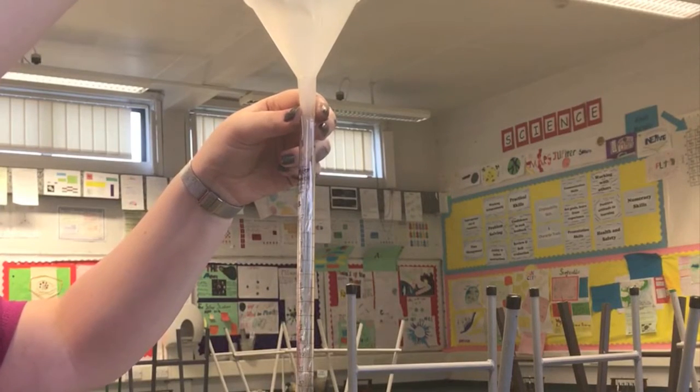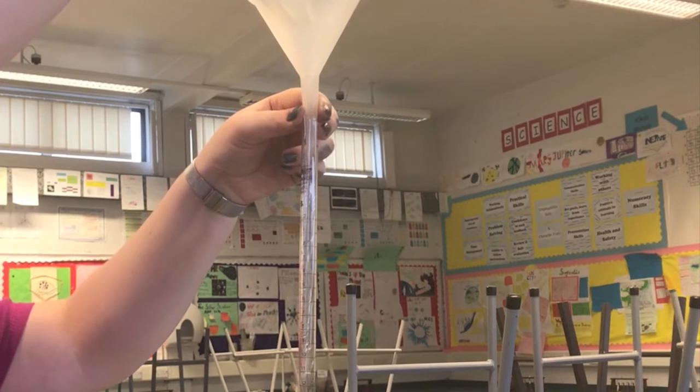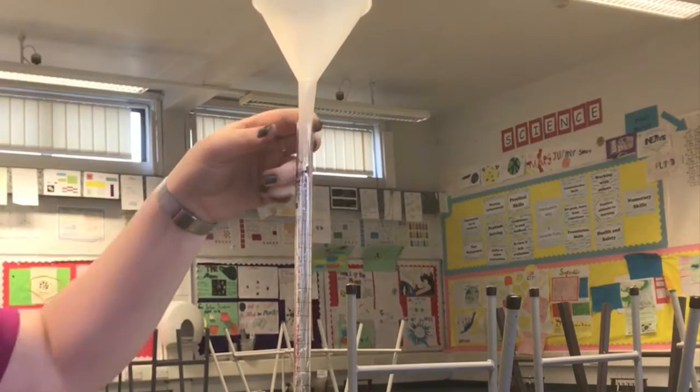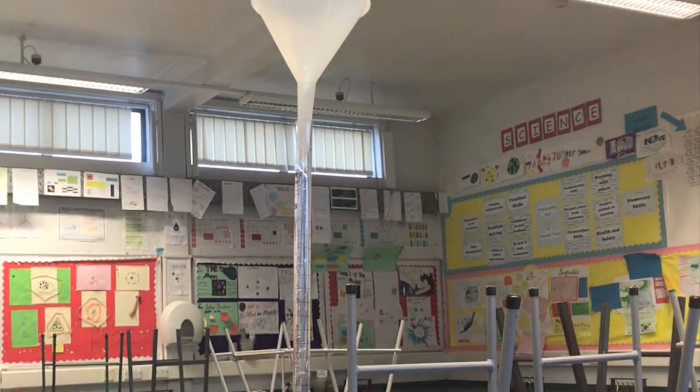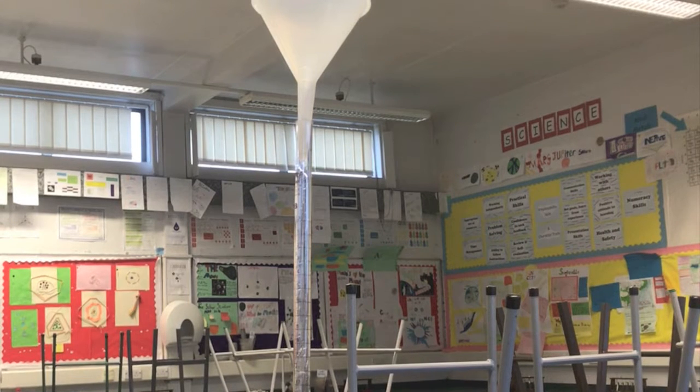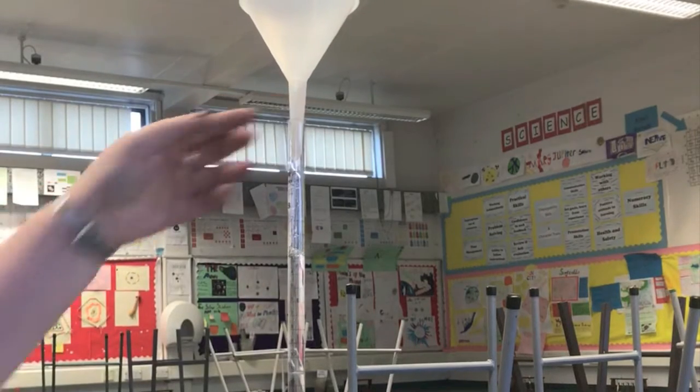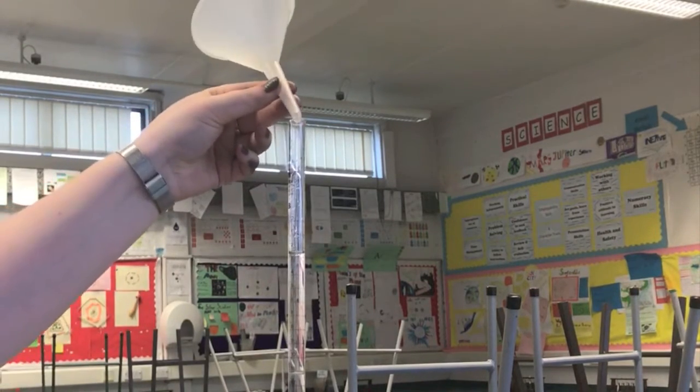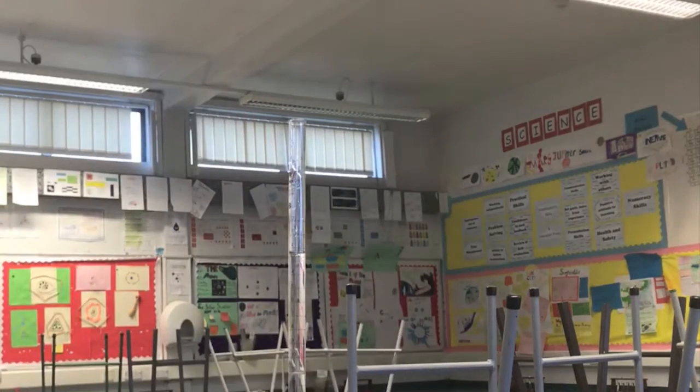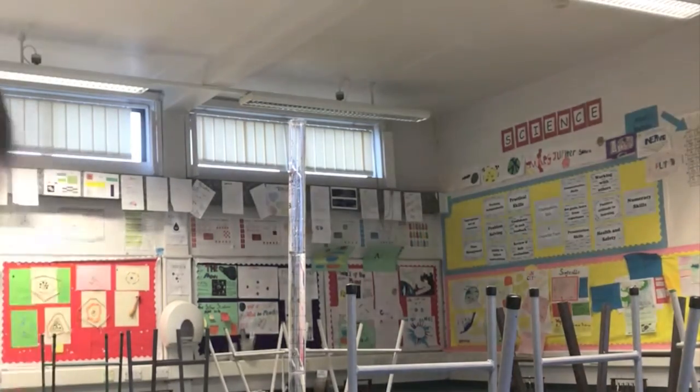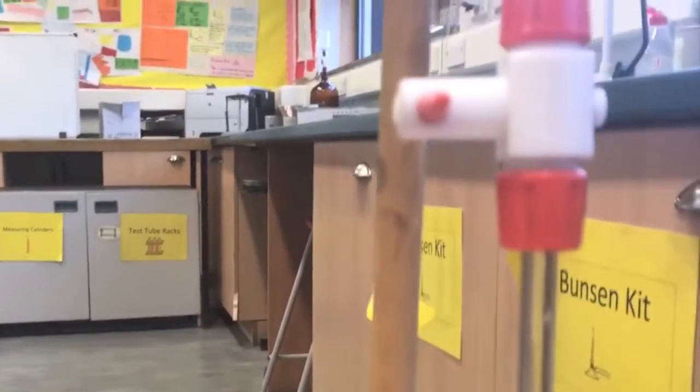The burette is filled with one of the two solutions. The funnel needs to be removed before the titration starts. If it was not removed then drops may enter the burette and change the reading. The tap is opened to ensure that the tip is also filled as this is part of the reading of the burette.